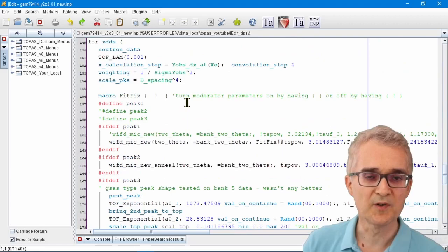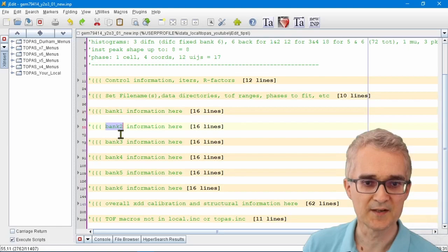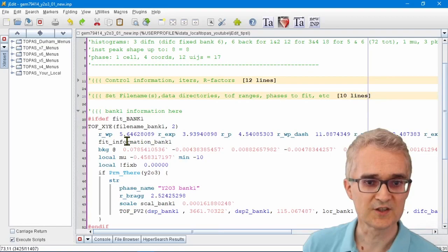If I view this in folded mode, you can see it's a very simple file where the information for the first bank of diffraction data is here, the second bank is here, and the third bank is here. If I want to look at an individual bank, I just click on it.